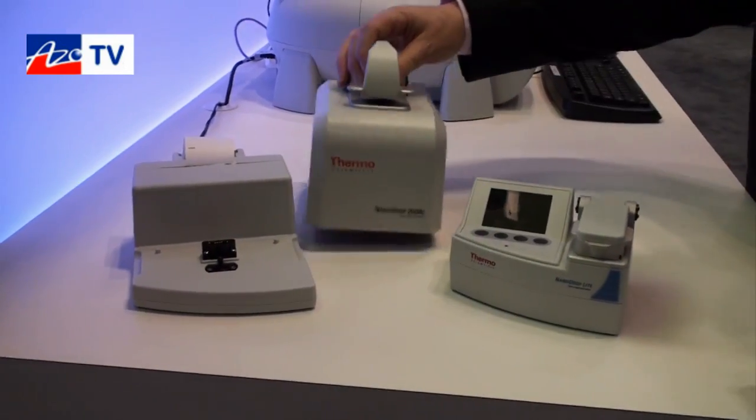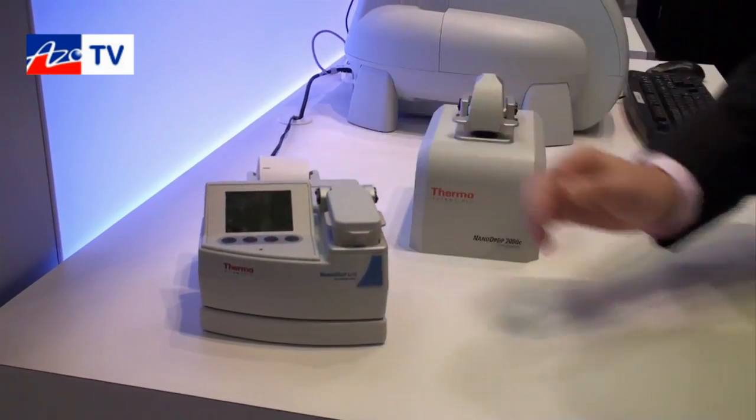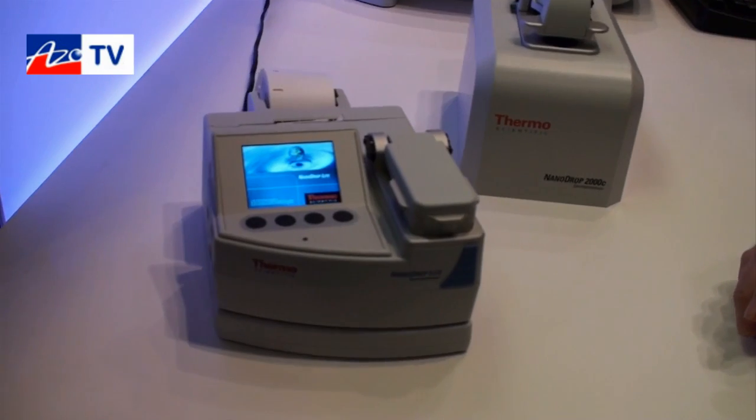It comes with an optional printer docking station. As we place it on the docking station, it powers up.